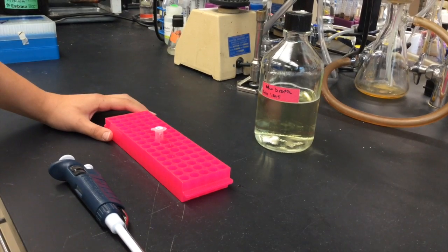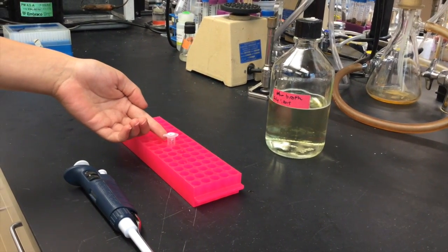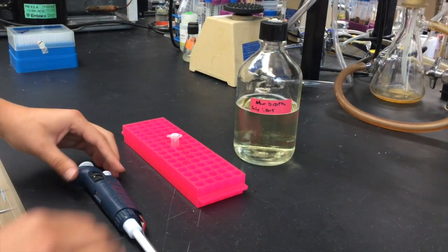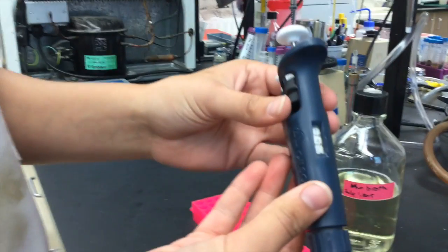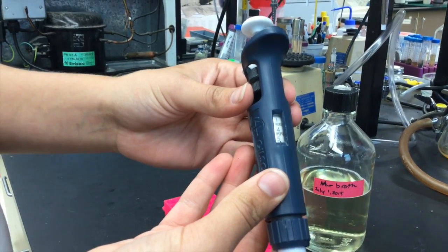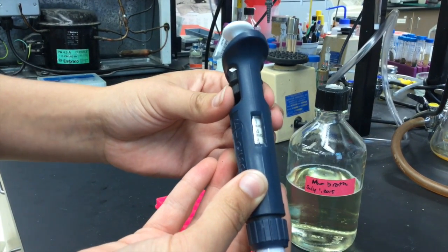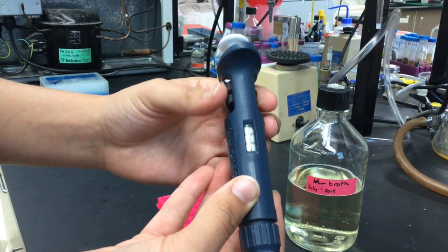We need to transfer 150 microliters of this antibiotic solution into this bottle of medium. So we need to set the P200 to 150. Set the desired volume by turning the centrally located rings clockwise to increase the volume or counter-clockwise to decrease the volume.